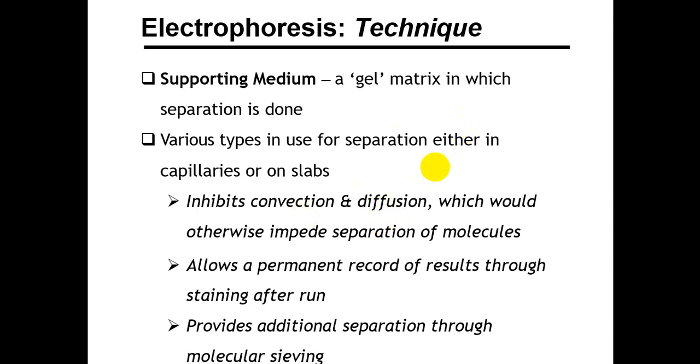The gel provides additional separation through molecular sieving. Like I said, the gel has pores inside it, and the pores provide for what? Molecular sieving, meaning that it allows smaller particles to pass through and prevents larger particles from passing through it.